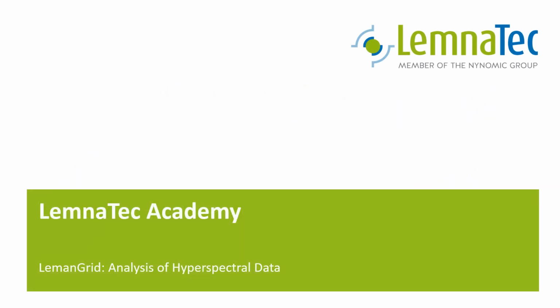In this video, we will explore how to analyze hyperspectral data in LemnaGrid. This video assumes that you have watched the videos in class 3. Let's switch to LemnaGrid.